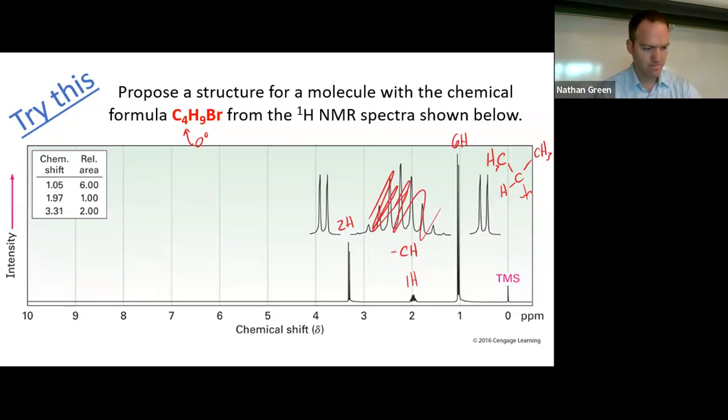It's just a multiplet. Now you're going to find out that they gave you the correct number of splitting peaks here, but we're going to just say it's a CH with lots of neighbors present. Right, there's one piece. There's another piece. Gee whiz, that's a CH with a lot of neighbors. It seems like I kind of drew a CH with a bunch of neighbors over here too. What are the chances that this CH and that CH are the same CH?